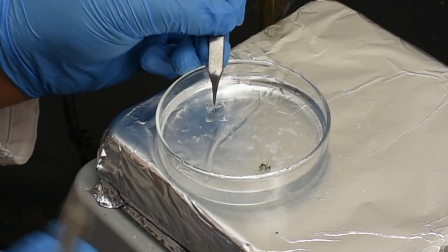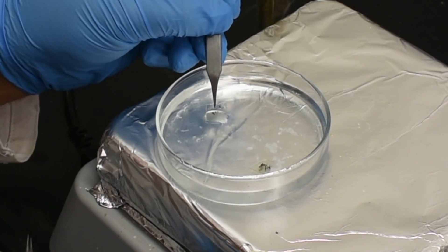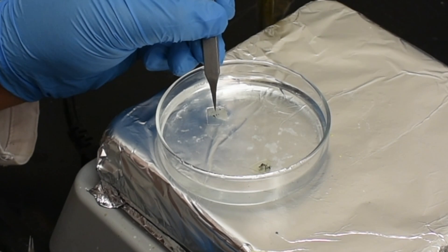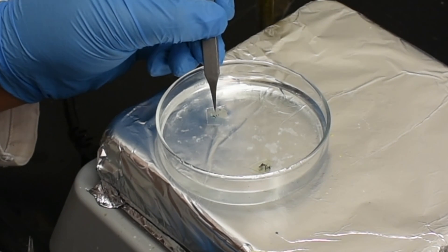Once an edge has clearly begun to separate, hold the substrate at a 45-degree angle and patiently let the water slowly separate the films from the substrate.